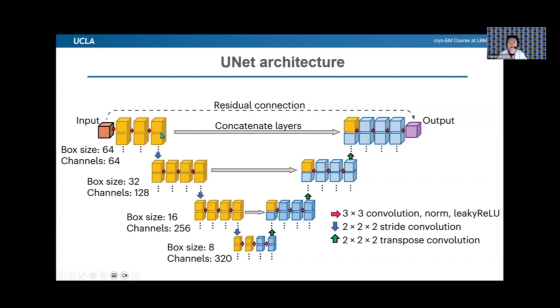And the good thing about the UNet is it trains the neural network not only at the original resolution, but also has downsampling layers. Downsampling layers make the neural network train at a lower resolution. So after three steps of downsampling, you can train the data with lower information, so it covers many different ranges of Fourier space.